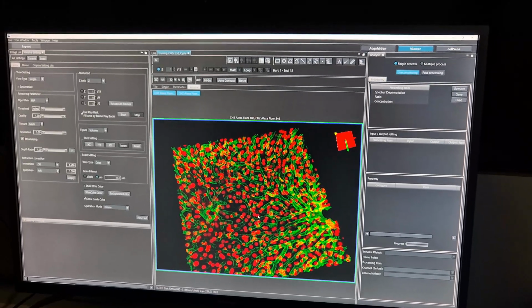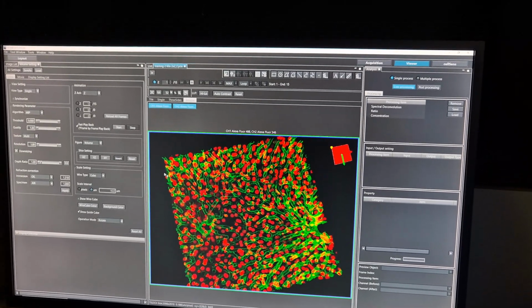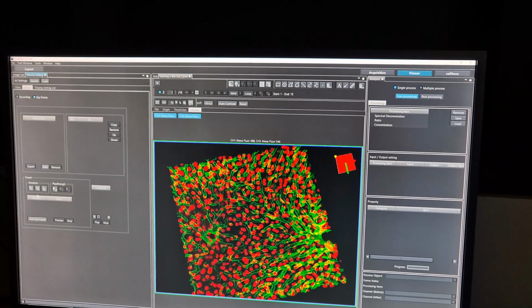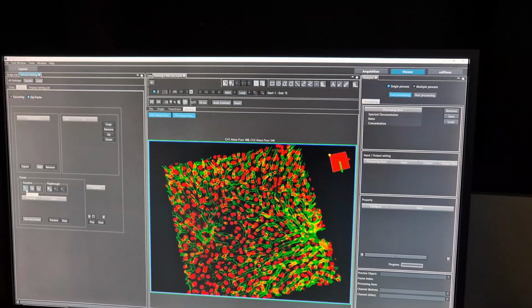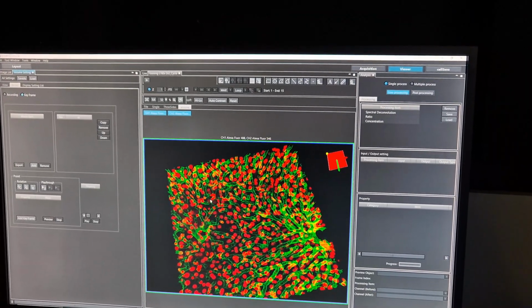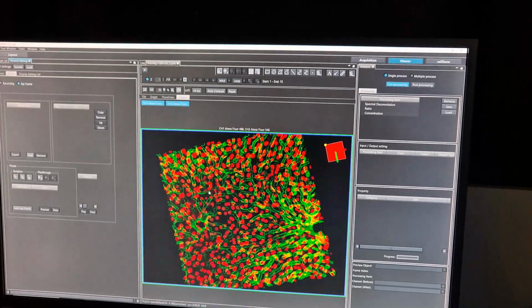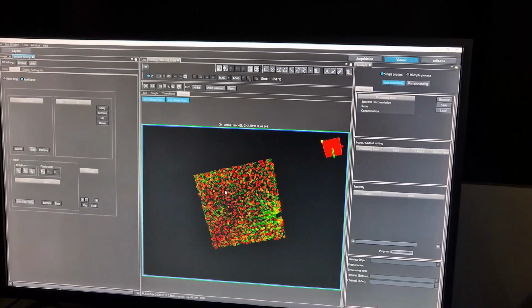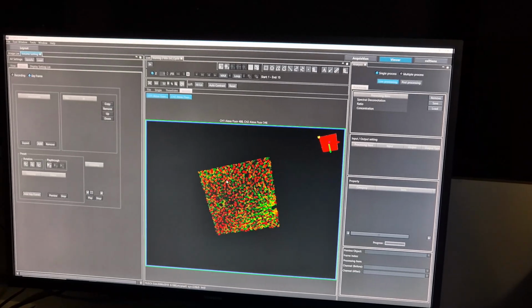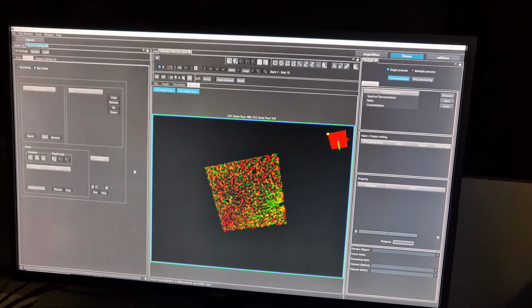And you can create a movie from here pretty easily as well. So you can go to movie, keyframe, and you can give it certain rotation values. You can actually just move it. If you hold down shift, you have this ability to zoom like this. And so you can do things like just keyframe your own organic positions.